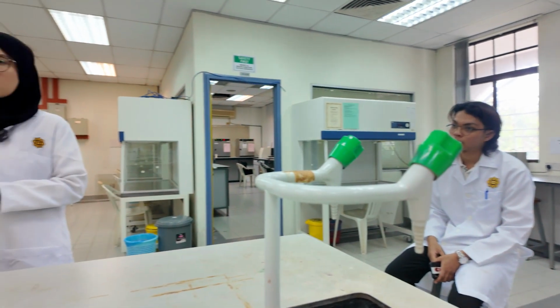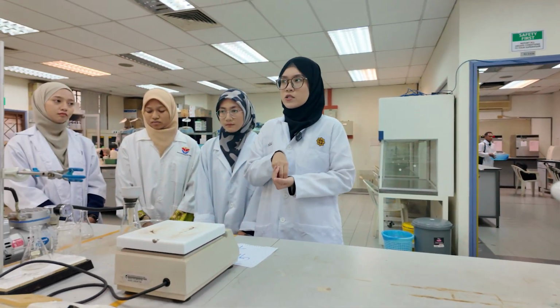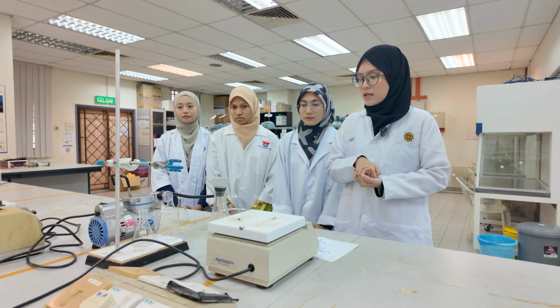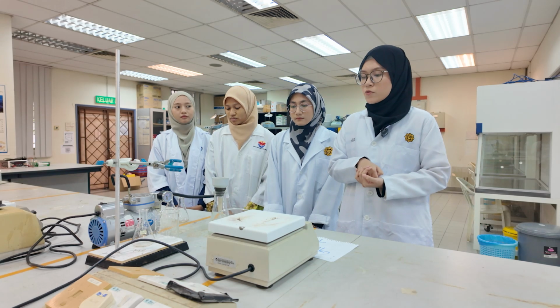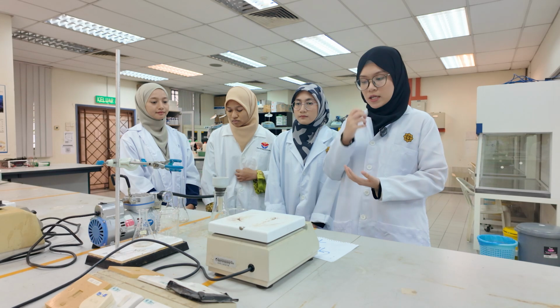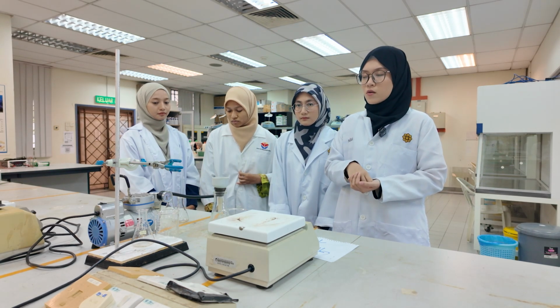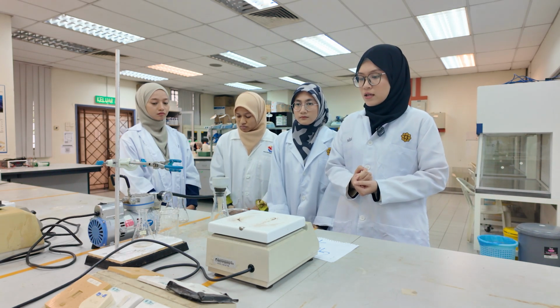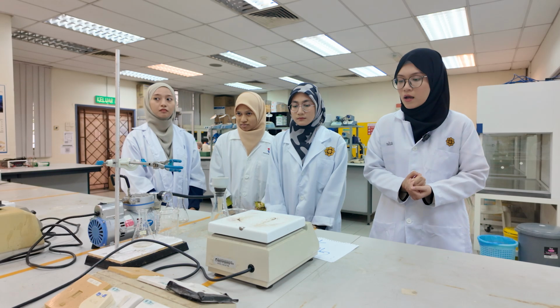Next is the precaution. The key precaution during the process is we have to choose the right solvent and use the minimum solvent to purify it without losing any product during the process. And next, we have to let it cool at room temperature, so the formation of crystals will be better.